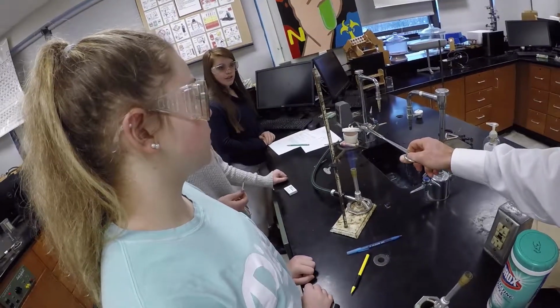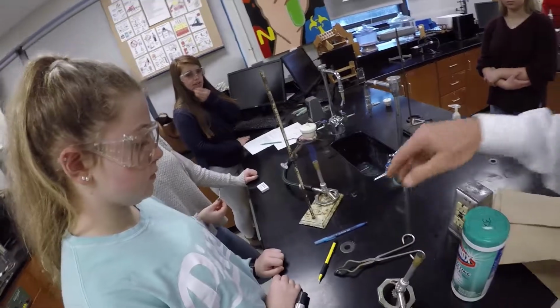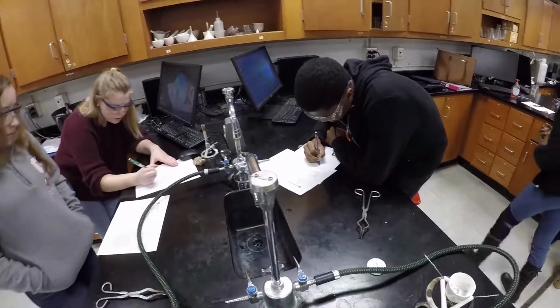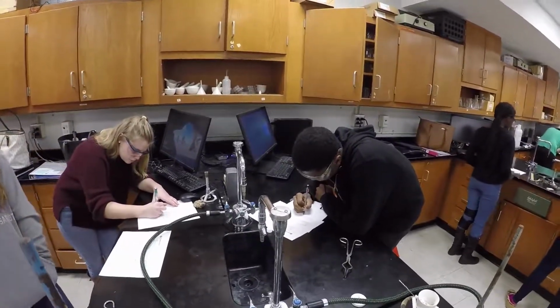So we're just going to gradually put the cap back on and let it cook a little bit more. And then we'll take the cap off probably one or two more times. Now make sure that you weigh it with the lid if you started with the lid.